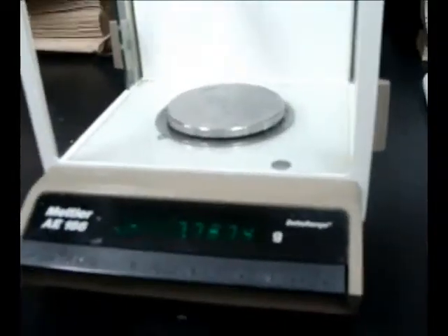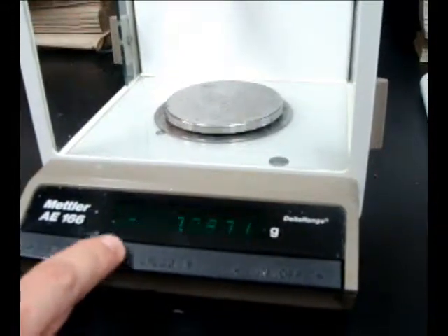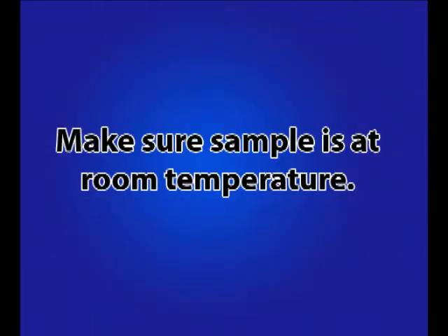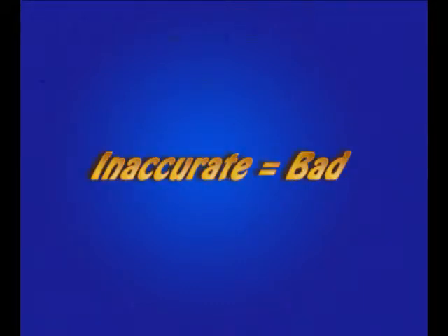If the digital display on your device shows a value other than zero, press the tare button located on the front of the balance to re-zero the device. Make sure the specimen you are to measure is at room temperature, as this avoids pressure changes within the measurement chamber that will cause inaccurate results.